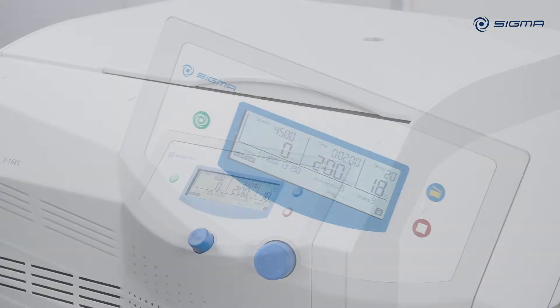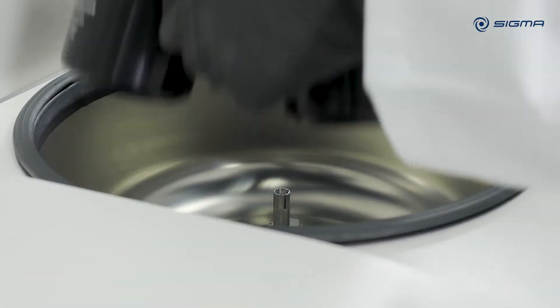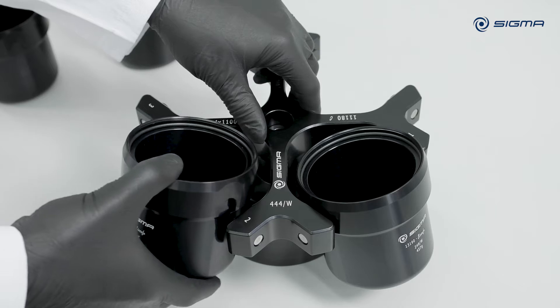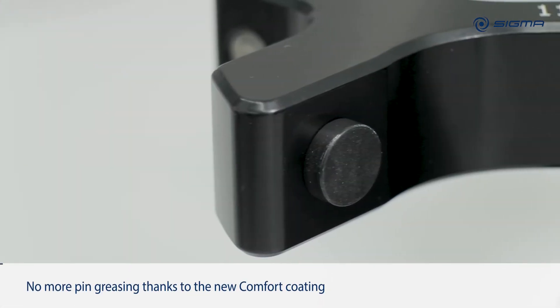Cleaning and care of centrifuges and accessories is an important prerequisite for long-term safe operation and for optimum separation results. In swing-out rotors, regular greasing of the pins that carry the buckets is very important. Irregular or no greasing leads to incomplete swinging of the buckets and, as a consequence, to imbalance.